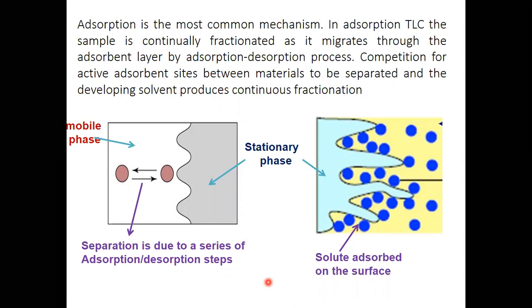The mechanism is based on the process of adsorption-desorption. Here you can see that at the active part of the stationary phase, the solute molecules are attached or retained. As the solute moves with the mobile phase over the stationary phase, there are several adsorption-desorption processes.